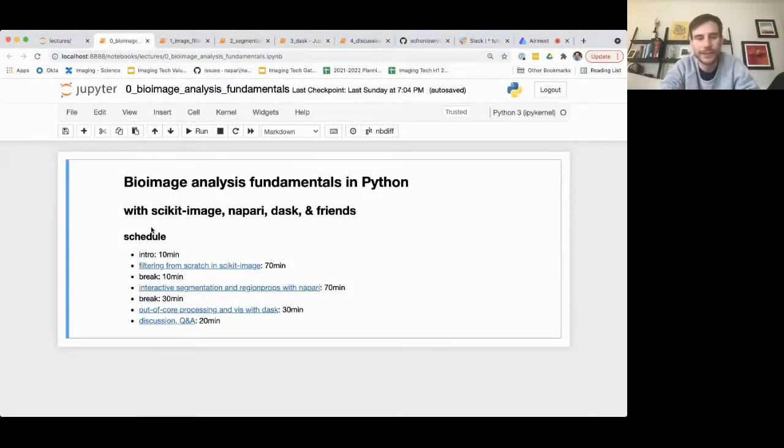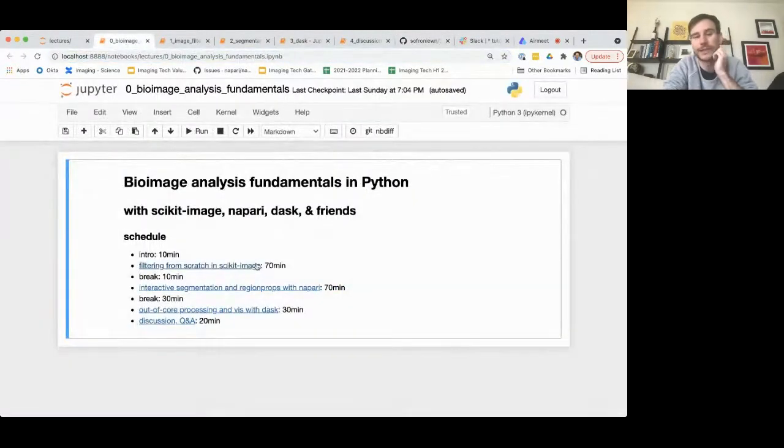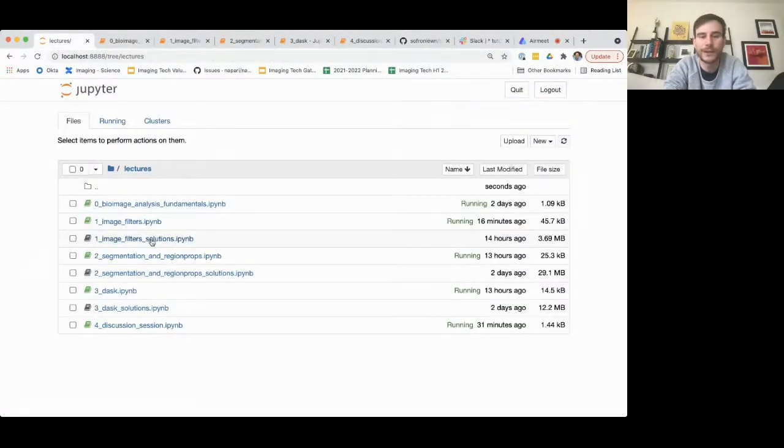I'm imagining that we're going to spend about 5 to 10 minutes now in this intro period as folks join. Again, here's the repository, and then we'll get going with lesson number 1. People will also notice that there are 2 copies of all the notebooks. There's one that is unrun and with no solutions, and there's also one with the solutions. If you're interested in a more interactive experience, I recommend going through the ones without the solutions. If you just want to read along, there are solutions for a lot of the exercises in the solutions ones as well.